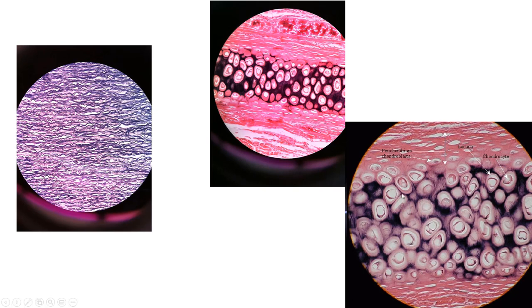Moving into cartilage, this is elastic cartilage. So this is probably a better view of it because you should be able to actually see the elastic fibers. Big places we have it are going to be the external ear and also the epiglottis. So elastic cartilage.